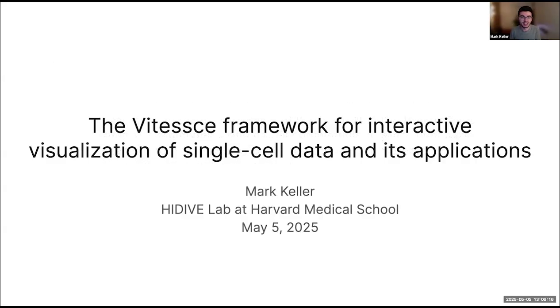Today, I am joining you to discuss our Vitessce framework for integrative visualization of single-cell data, and I will also discuss some applications.